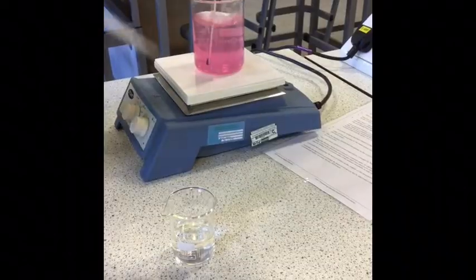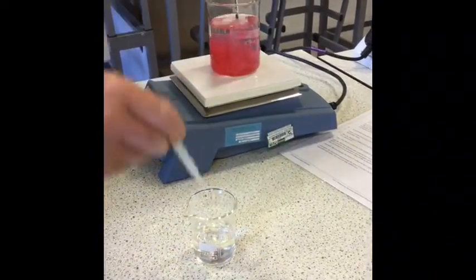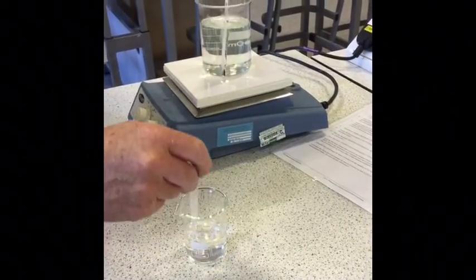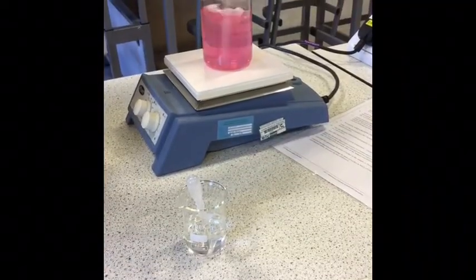In reality, when doing this experiment, I found that I had to add a lot more than 30 cubic centimetres of the ammonia solution. It was probably near 100 mils that I added before we got the permanent red precipitate.